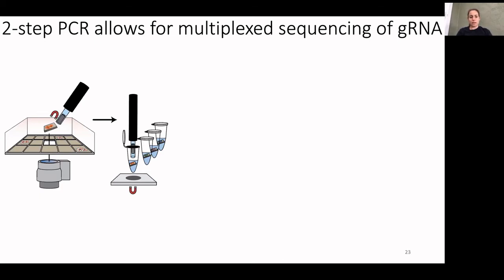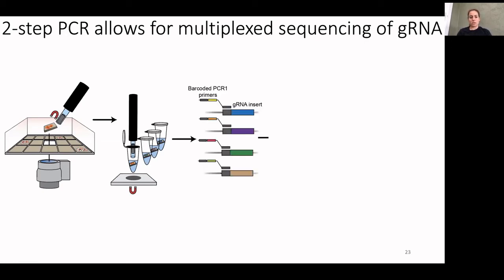So this again is a limitation in terms of throughput, where we were able to select 100 colonies over the course of about 2 days. But as you have to spend about 2 minutes collecting each one, I think that collecting thousands of colonies would be difficult with this method. However, the Albritton lab and the engineering labs who developed these arrays now have robotics platforms to be able to do this robotically, but of course that's a little bit more expensive and requires specific machinery.